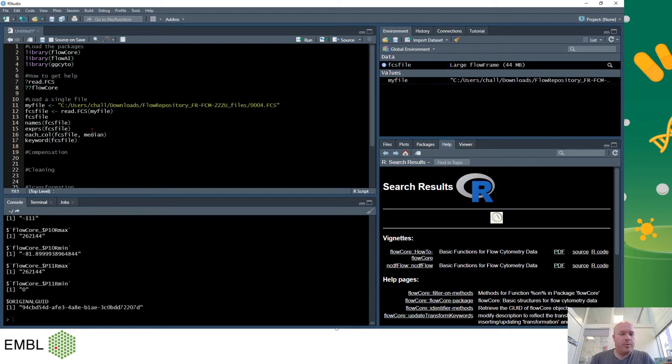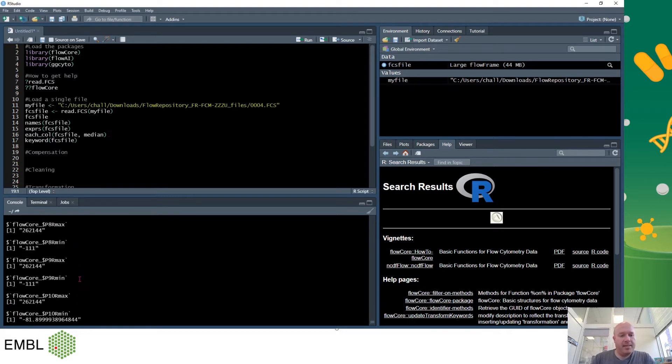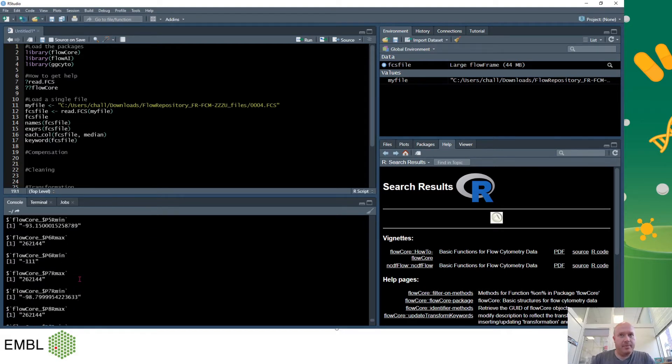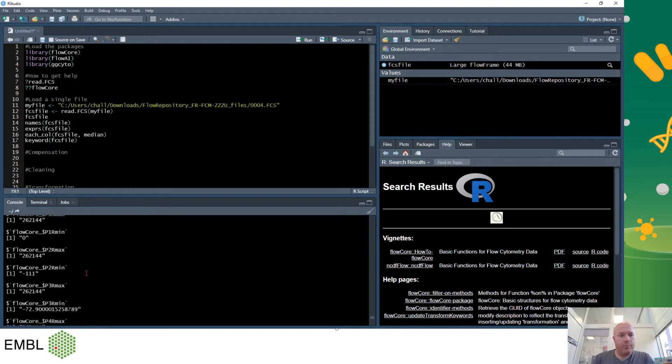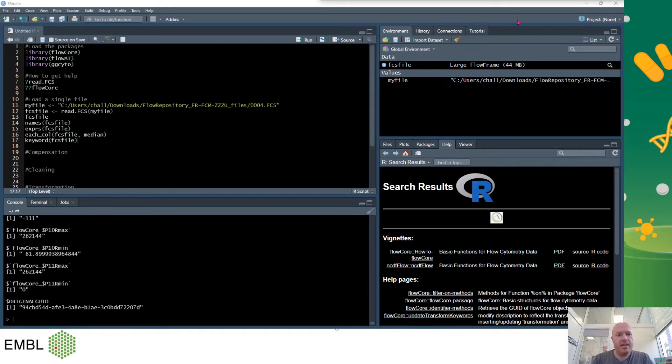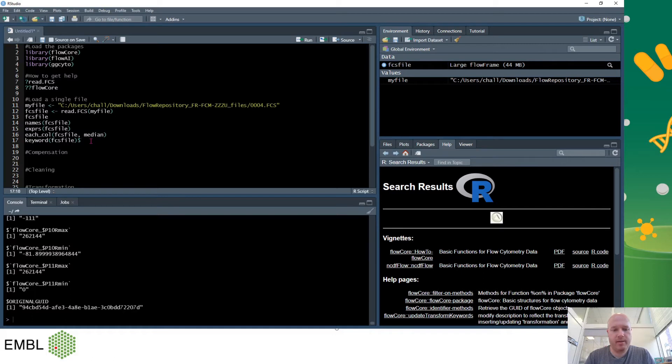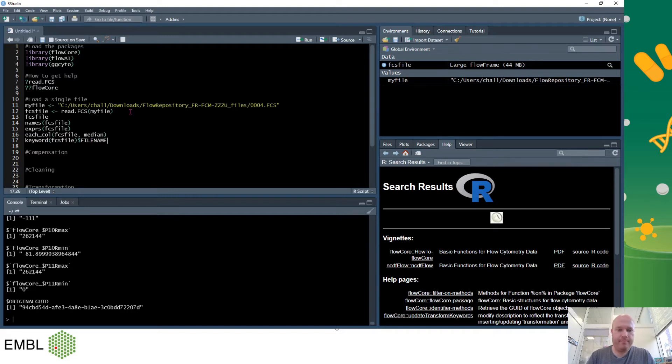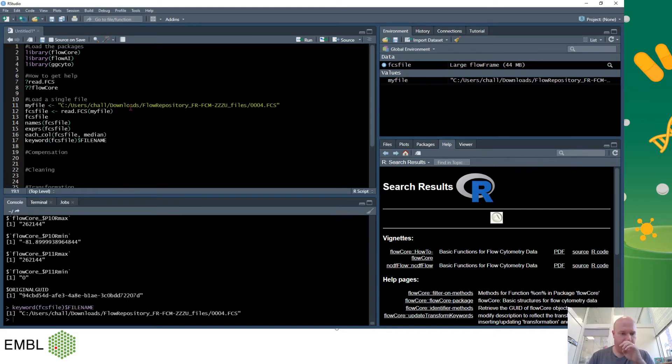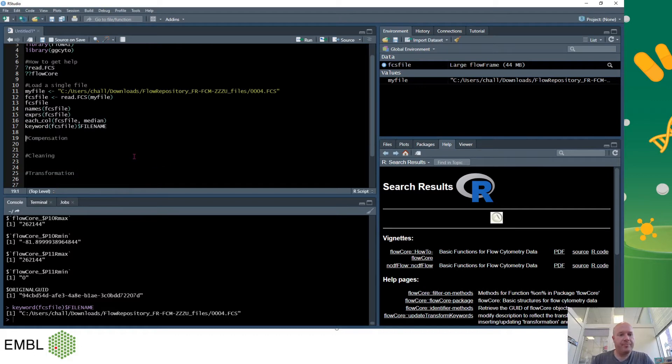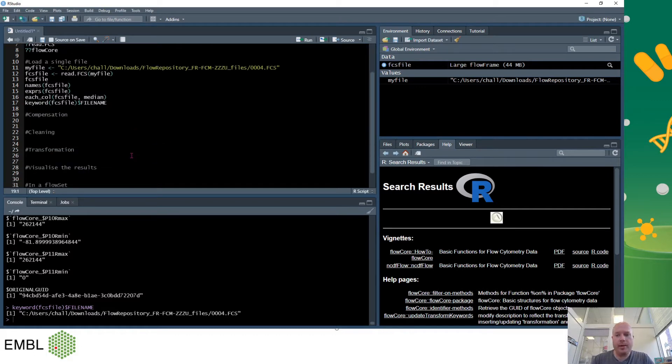Perhaps the most useful command or at least the command I use the most is the keywords command. So this one gives you all the metadata from your file. If you want to look at a specific one you can use the dollar symbol and type in the parameter you want or the keyword you want, for example file name, and it will give me the keyword for file name. There's a lot more power available in FloCo and you should read the help documentation to find out more.